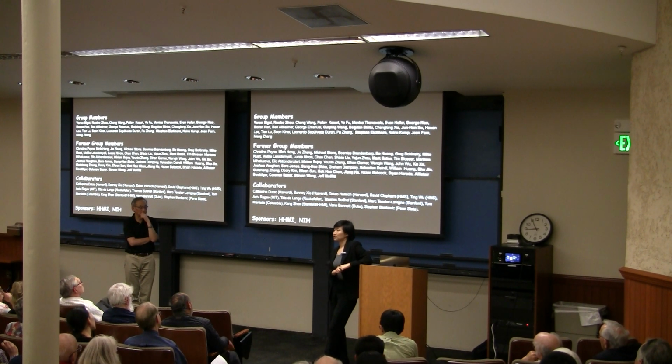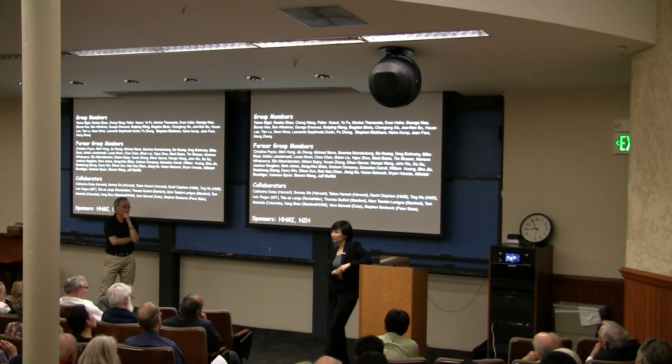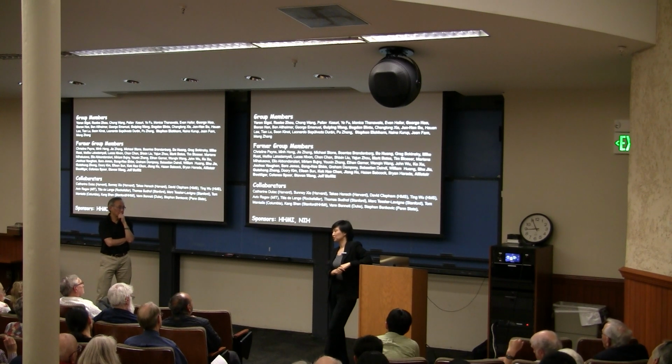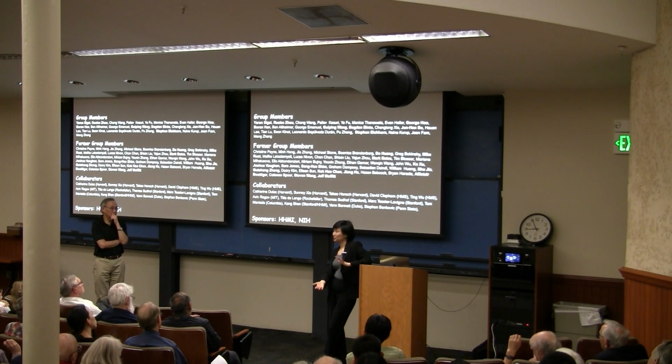The third level is the hardest, and that is the scattering. So once you go deep enough, light scatters. And with that scattering, imaging quality gets very much deteriorated. Now, there are active efforts, but not great solutions yet, in dealing with the scattering-induced problem. But these things happen deeper and deeper.